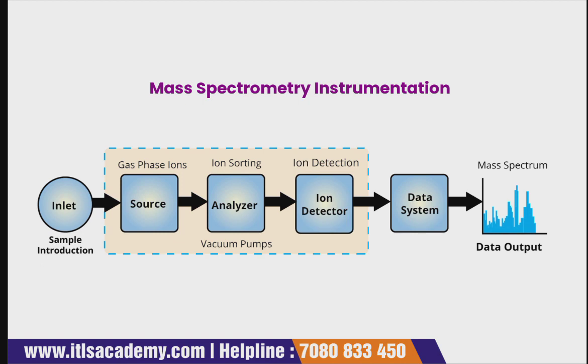Then it has a source, basically for gas phase ions. Then it has an analyzer, basically used in ion sorting, and it has an ion detector for ion detection, and it has a data system and further data output.